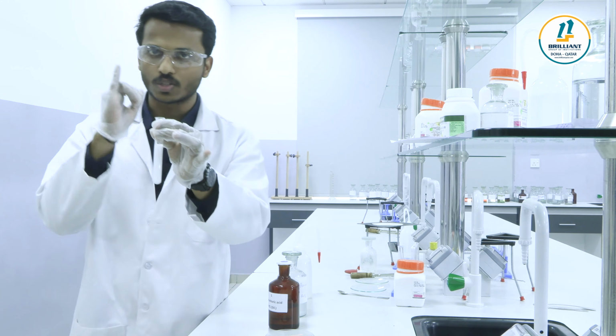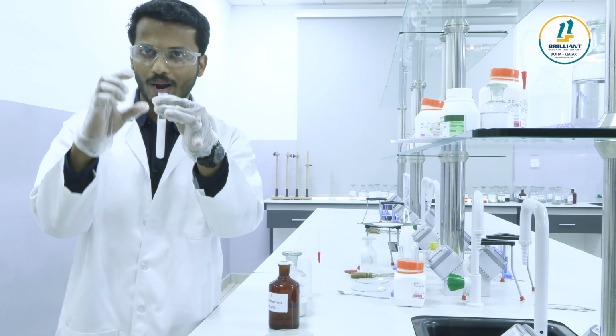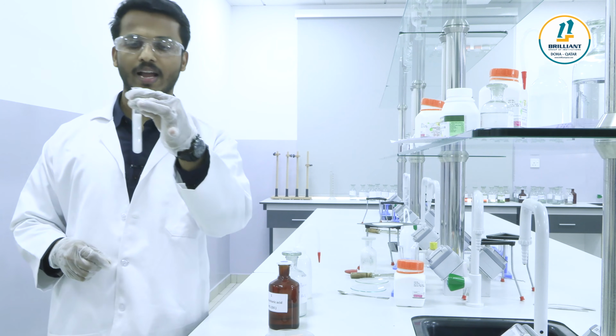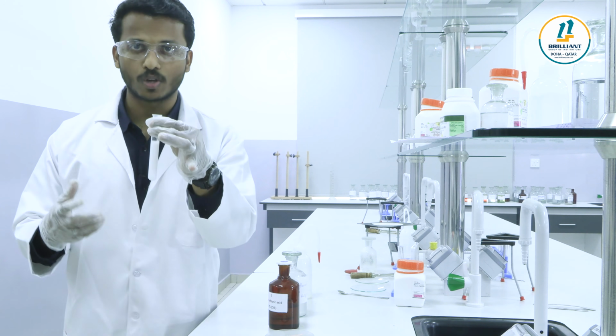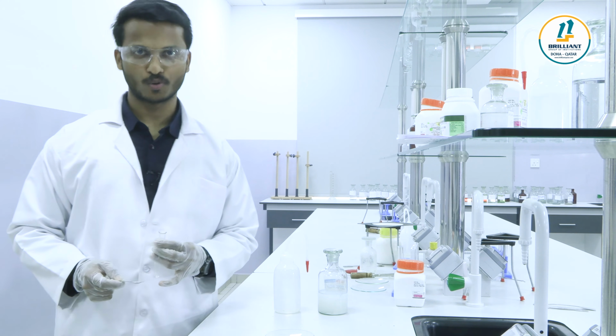So, to the salt solution we add barium chloride, which first forms a white precipitate that is insoluble in dilute HCl, indicating the presence of sulfate. Let's go for the confirmatory test for sulfate ion, SO4 2-.